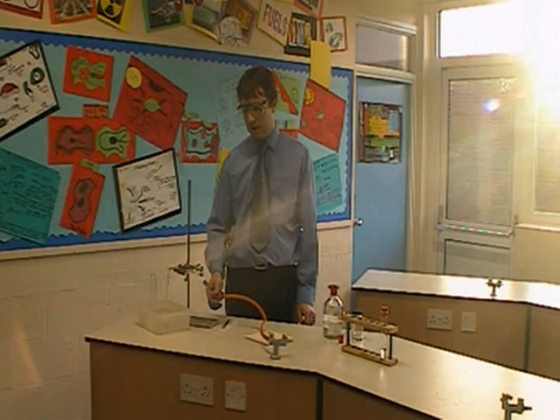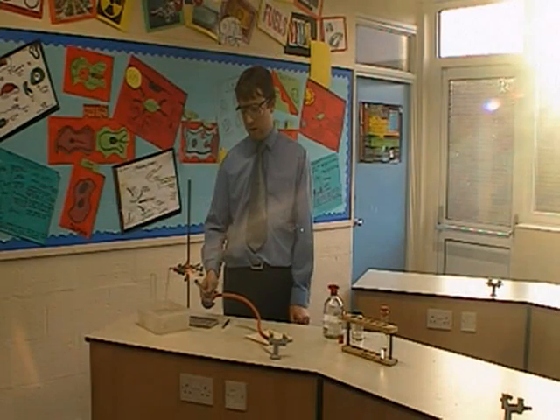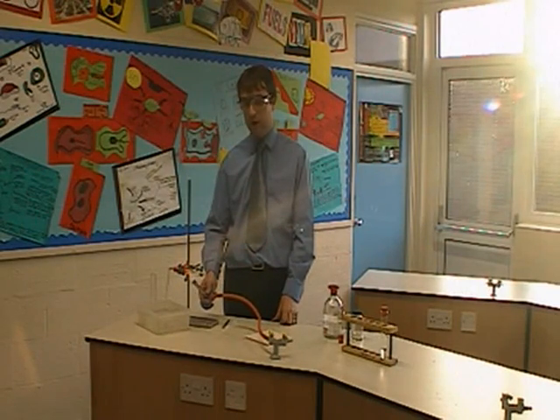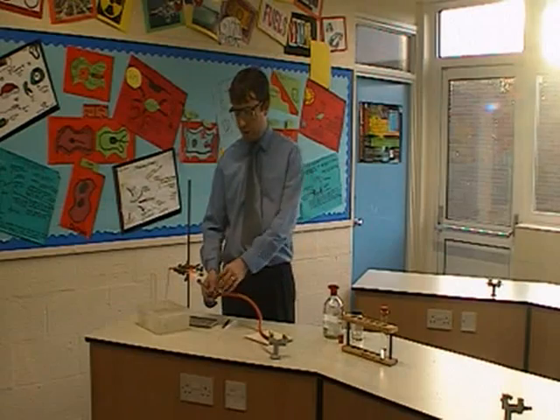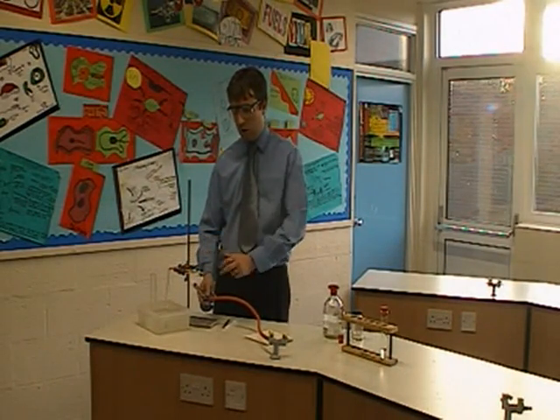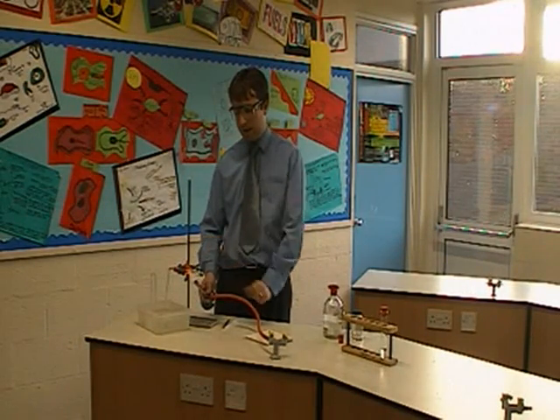One of the problems with the reaction is that if we take away the heat when the reaction is happening, we can end up sucking back water into the test tube, which can produce a jet of steam — that's one of the areas of safety that people have difficulty with. We also need to be aware that we're not setting fire to anything in the clamp stand, particularly if it's a rubber clamp stand.